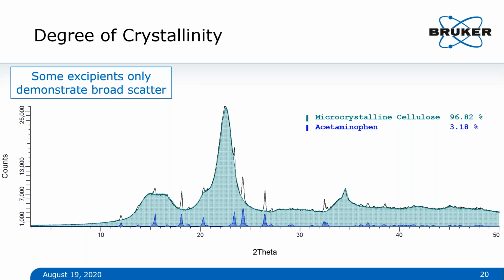Fantastic. Next question is, sometimes we analyze formulation samples and we see significant interference from microcrystalline cellulose excipient. How can we avoid interference in the analysis?